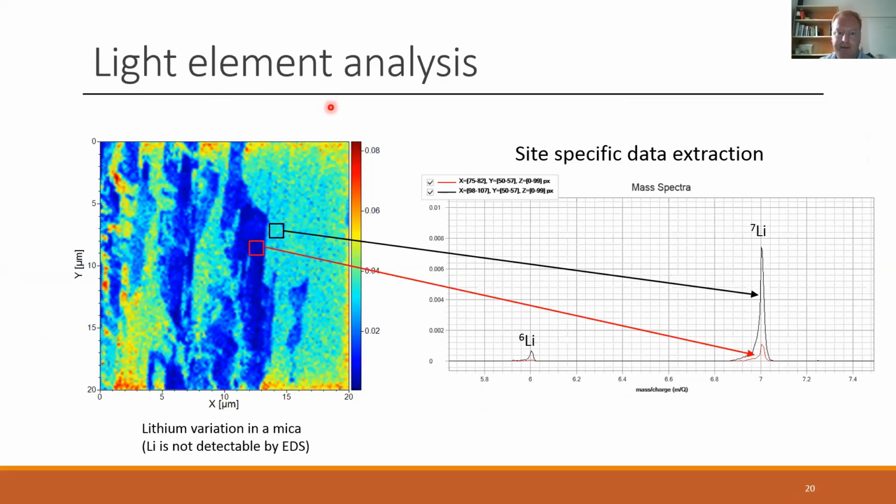In Western Australia, there are a number of lithium mines, and lithium batteries worldwide are becoming a very high interest commodity. So we're looking at lithium distribution in the batteries, but also in the material that's being mined. Lithium being an alkali has very, very high sensitivity, so we should be able to quantify down to just a few ppm.